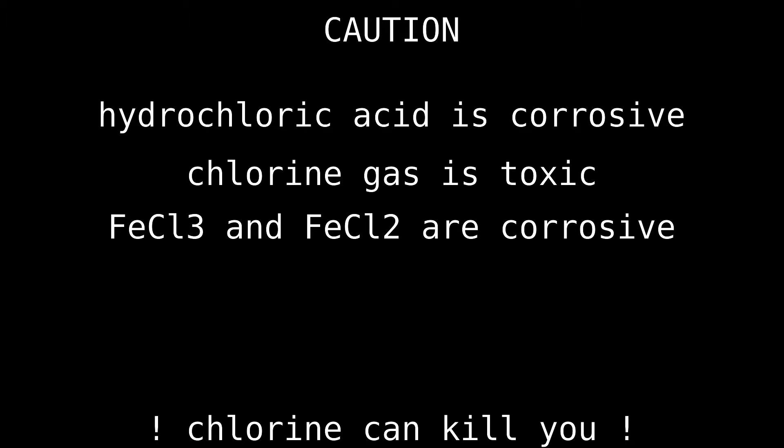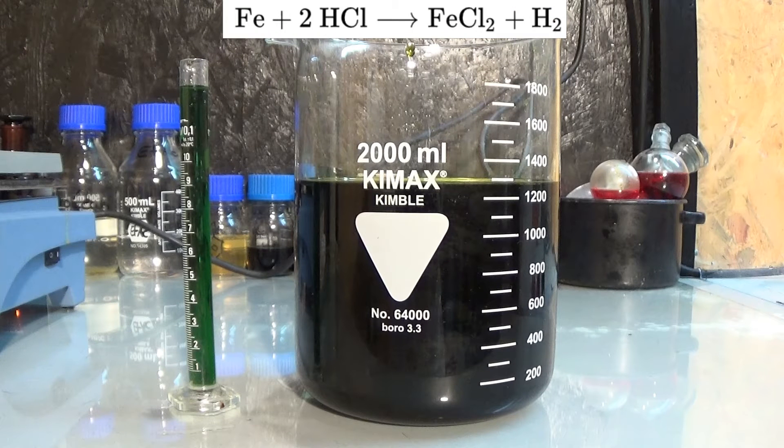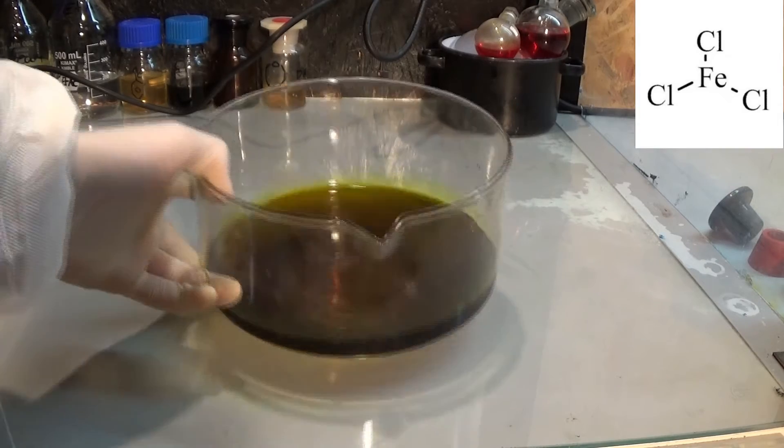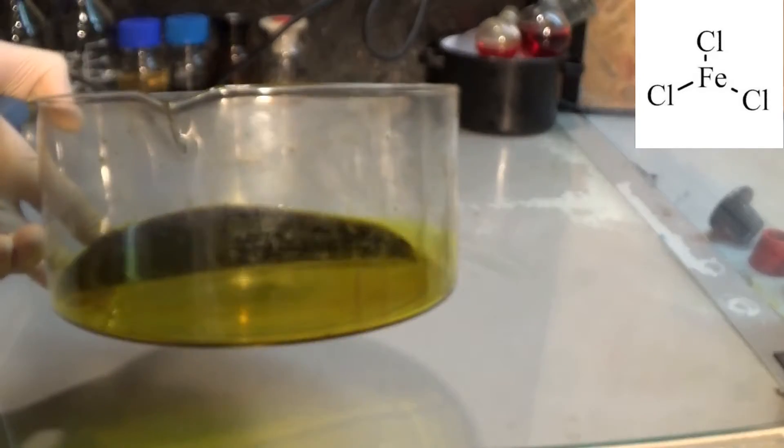So I had a problem. I had like one and a half liters of iron 2 chloride in solution, and because Mr. Krabs was a big role model for me, I did not want to waste any chemicals. So I asked myself what use this stuff could have. Then I remembered that you can oxidize it into iron 3 chloride, which has a dark solution with yellow tone.